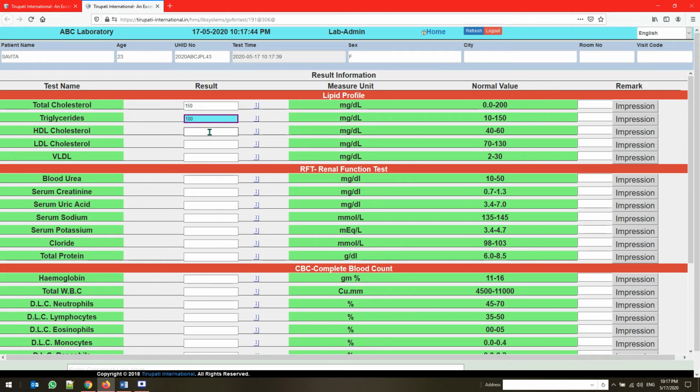according to the results coming from the devices or machine. If the result is abnormal, it will be indicated by the system, and a red mark will be added at the lower limit or higher limit of the given standard value, so the user can easily identify it.